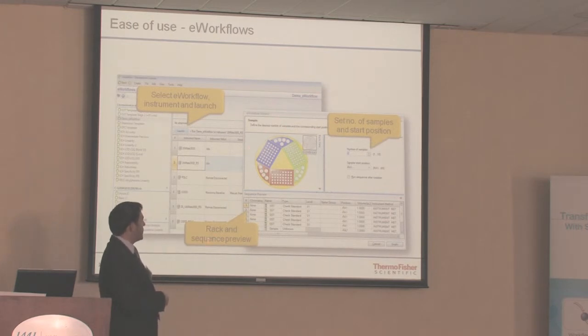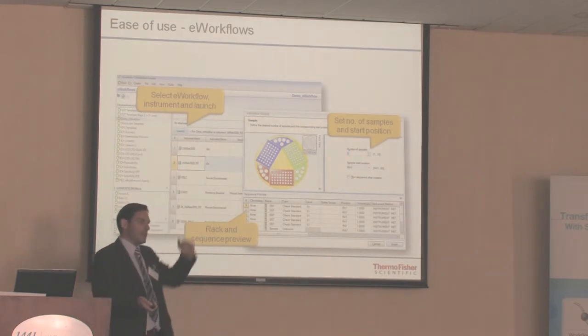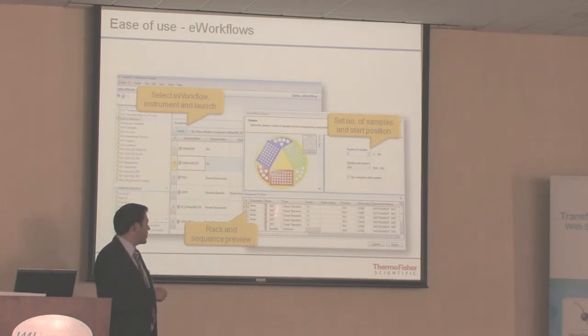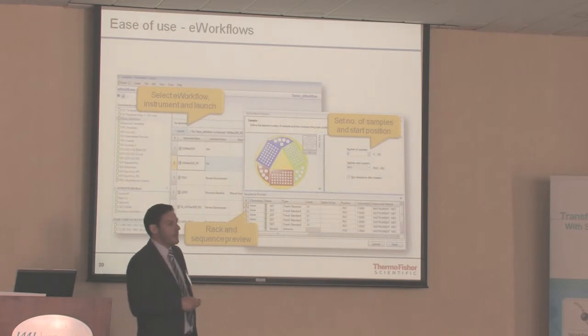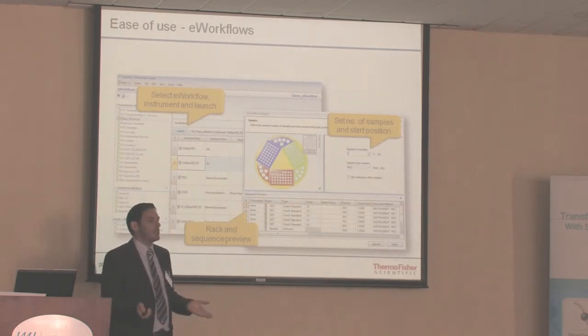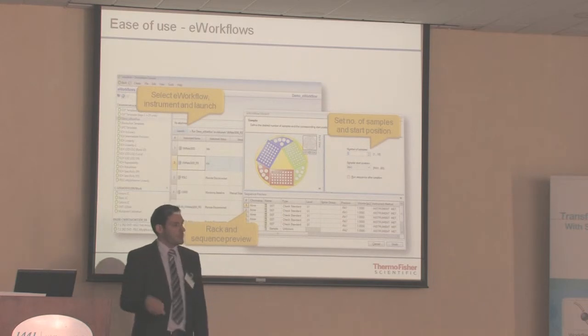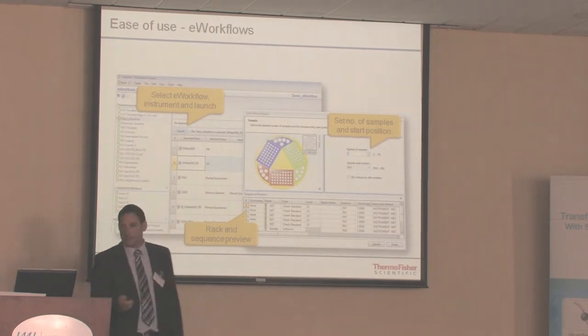So all they really have to do is enter their number of samples, where they want to start from, and do you want to run it straight away, or do you want to have a little look at it, want it to populate it, and then hit start manually. This part here gives you a nice little preview of what the sequence will look like. Particularly important if someone comes in and says, well, I want to have 3 samples, what will happen? And it'll populate the sequence for you here. It populates the sequence based on rules that meet the SOP in the first place, which meet the requirements you're trying to set up.